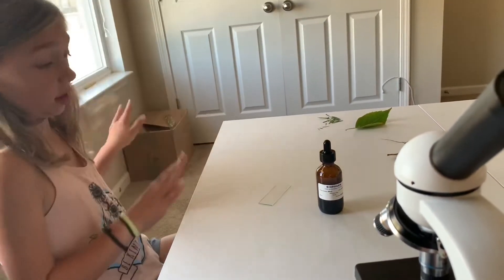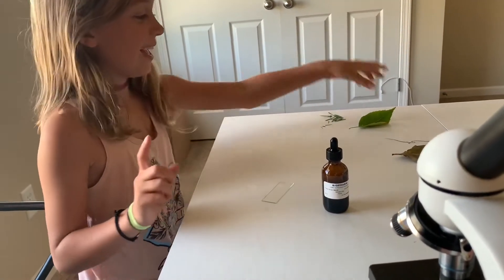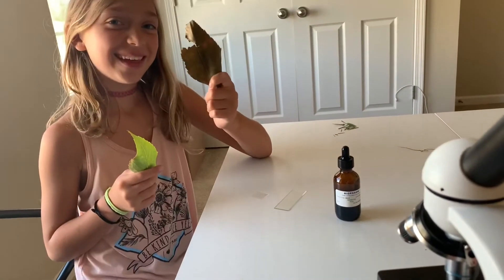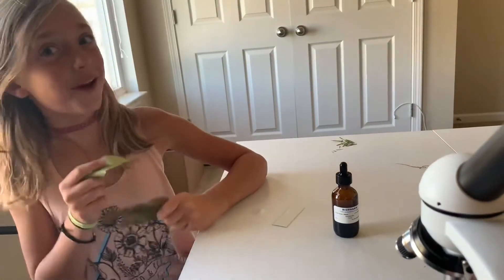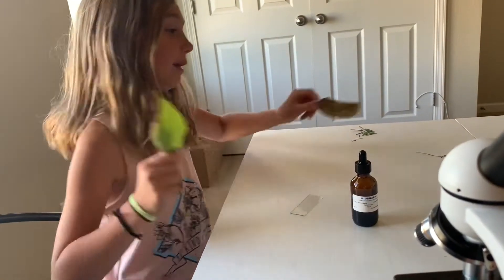First up, we're actually going to look at a green leaf and compare it with a brown leaf. In the last video I called it the diarrhea leaf. First up, we're going to do the green leaf.